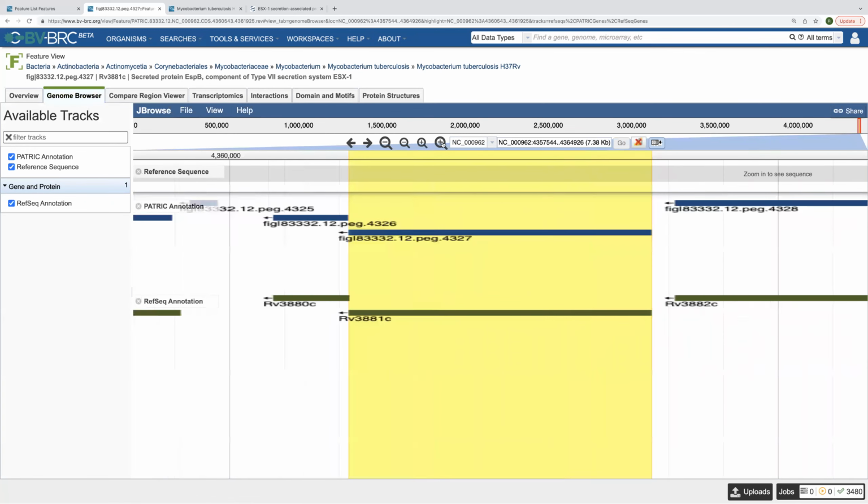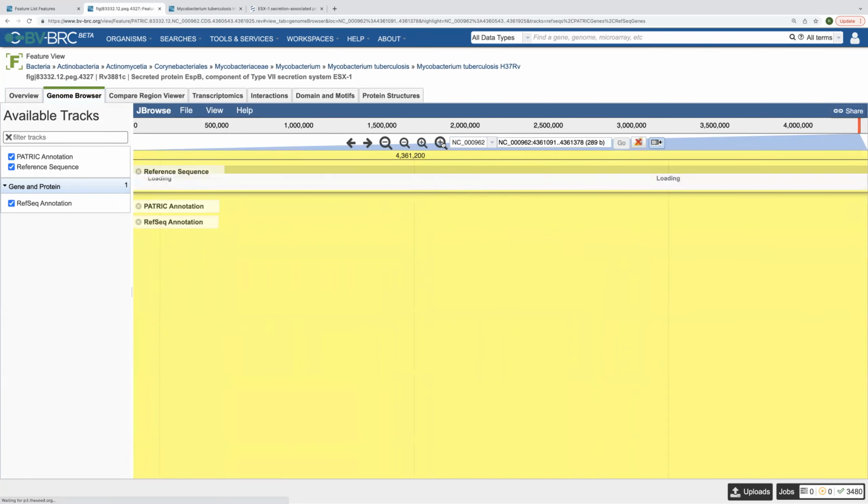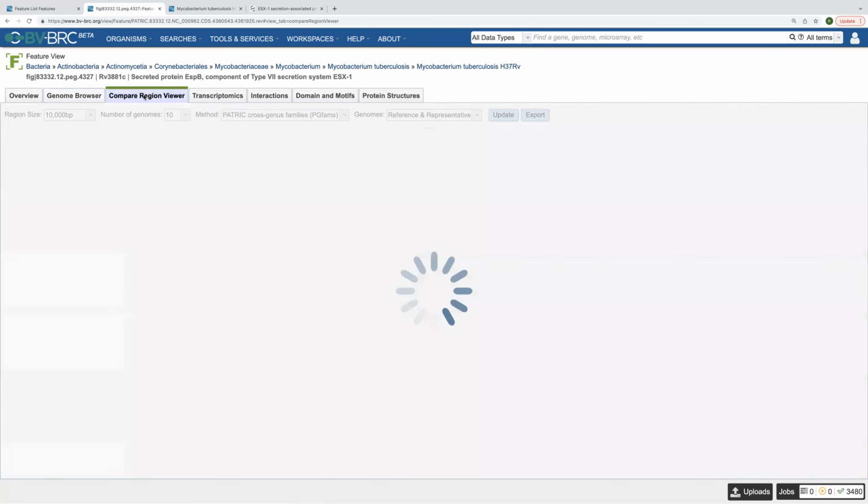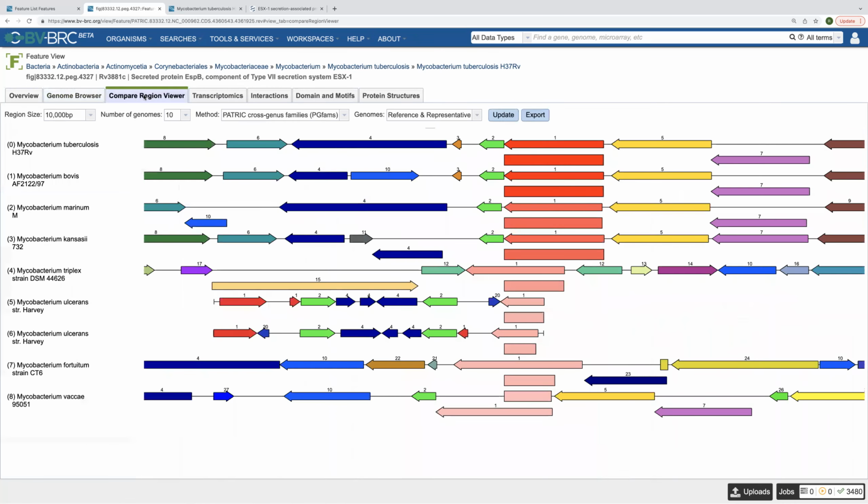And you can drill deeply down on this page until you get to the 6-frame translation. So if you have a gene that's broken, this is a good place to look and see what's breaking it. This is another thing we have only at the feature level. And this is one of the main reasons I wanted to start here to show you this.